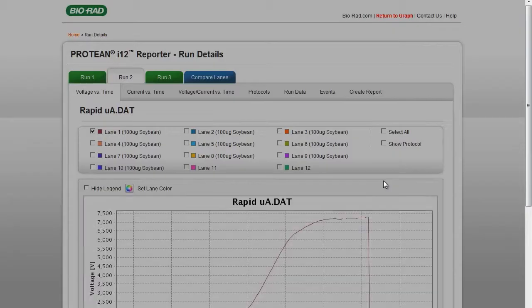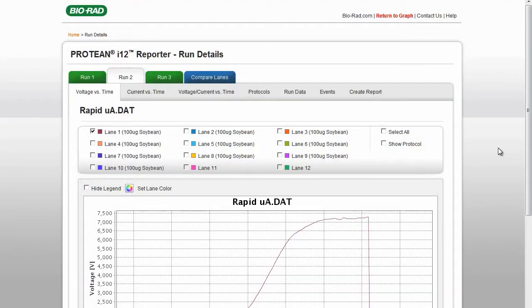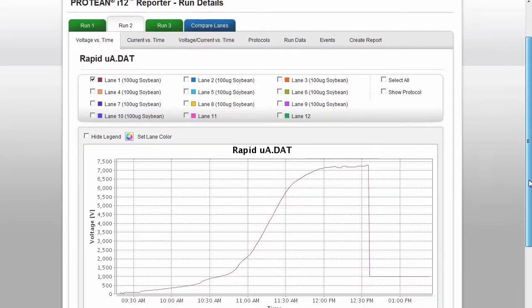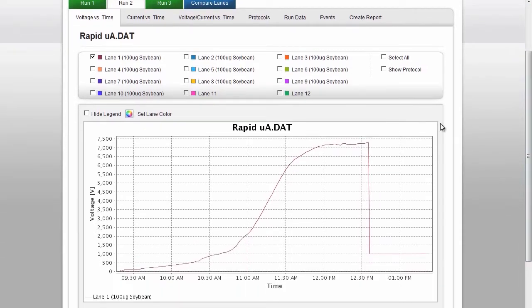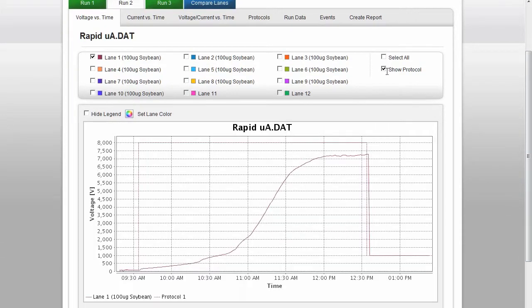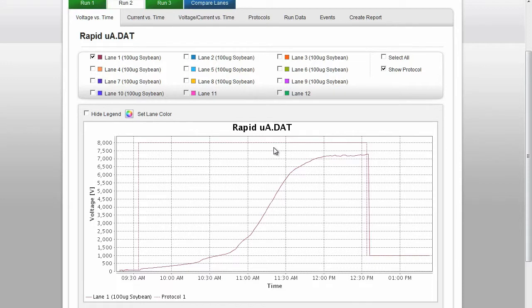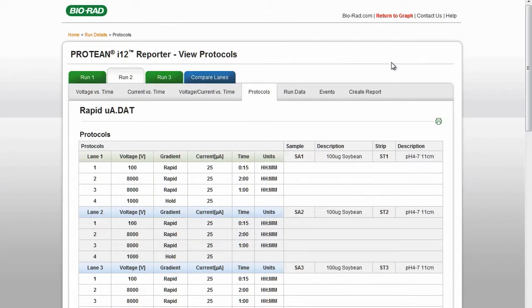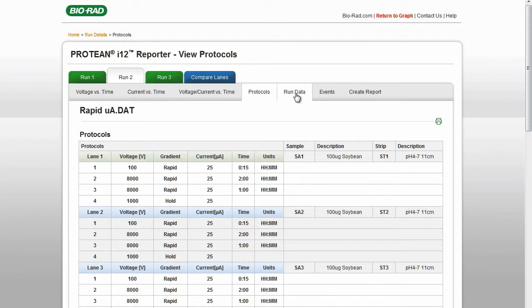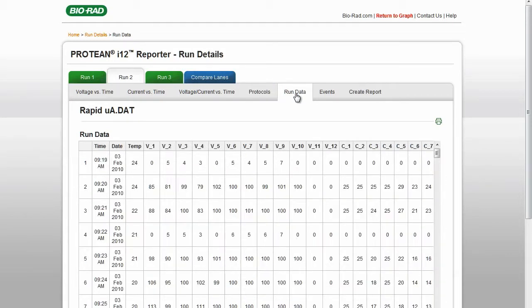Click the Show Protocol box to display the protocol that was programmed for that lane. The protocol is shown as a dotted line the same color as the lane. Click on Protocols to view all the protocols that were programmed for that run. Click on Run Data to see the raw current and voltage data from the run. Click on Events to see if the run was paused and when it ended.